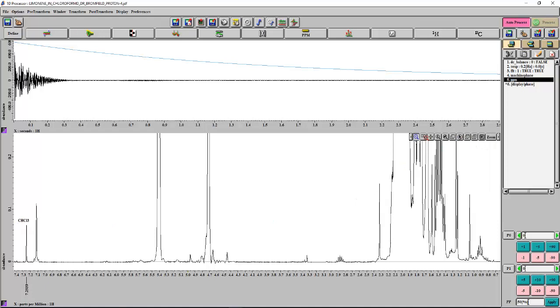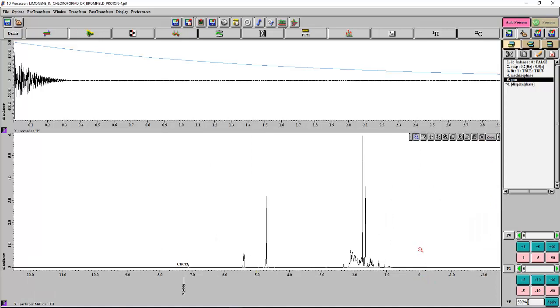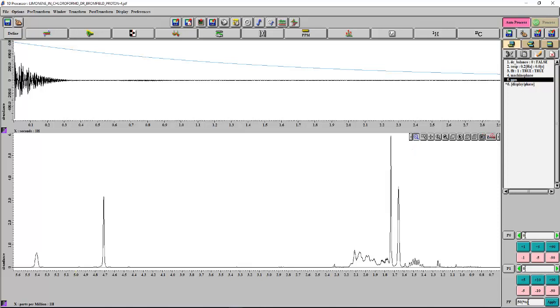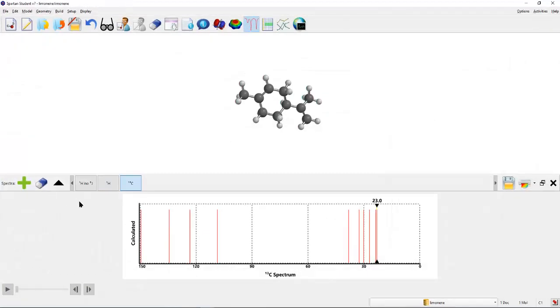The solvents that you are using for your NMR may have the standard in it that shows up at around 0. This one that I used did not. For this, I'll start with these peaks down here because these are on double bonds. I can integrate these two, and notice that these numbers are really high, but I can figure out based on my structure, if I go back to my NMR, what some of these peaks are.